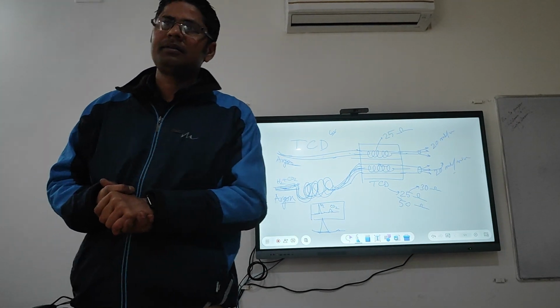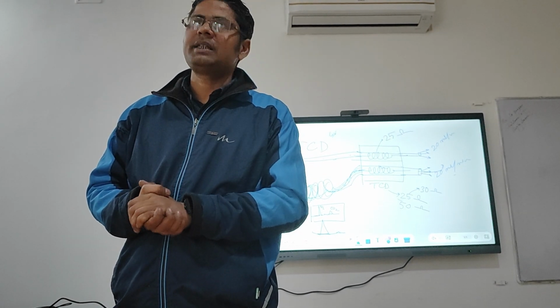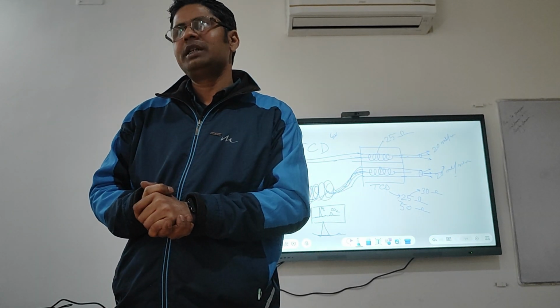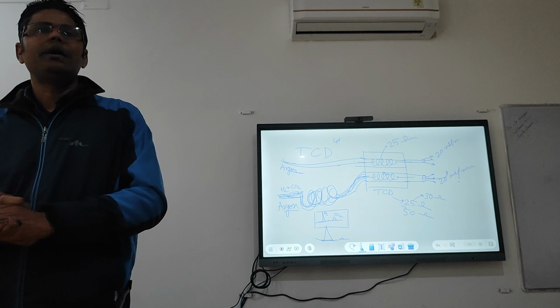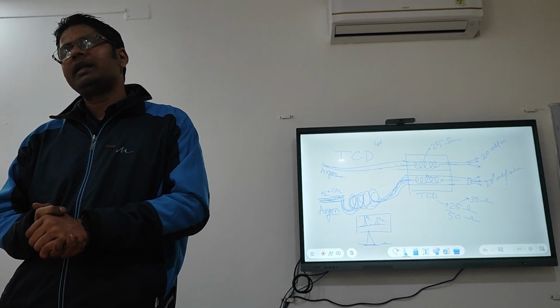In ml. Normally TCD is used for gas analysis. In 95% of cases, we will use TCD for gas analysis. Volatile gas, yes. Like hydrogen, oxygen, nitrogen. Methane is also a gas that can be detected in FID.